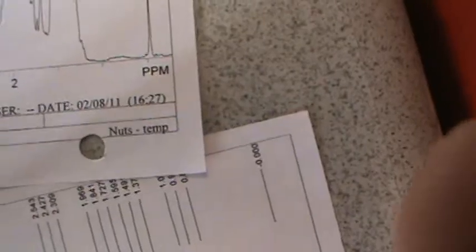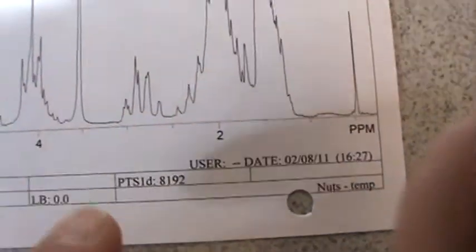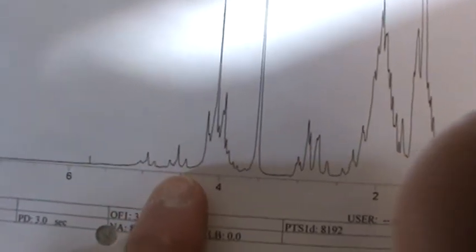And in fact, if we had TMS, and lo and behold, see that little TMS peak? It's supposed to be 0. This student set it at 0.465. So obviously, this is shifted this way a bit much. So when you recorrect it, you can see clear as day that will be the starting material, alcohol. And then these are the 2 other mystery types of products. In this case, 2 more. Don't know what they are for sure, but we definitely know there is something there, which is kind of interesting in itself. So folks, that handles the proton and the IRs.